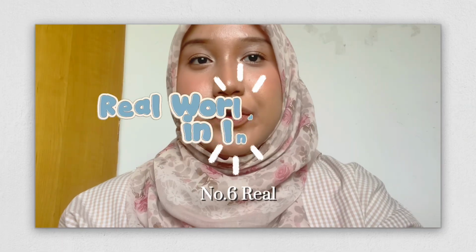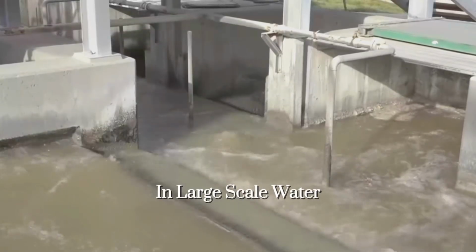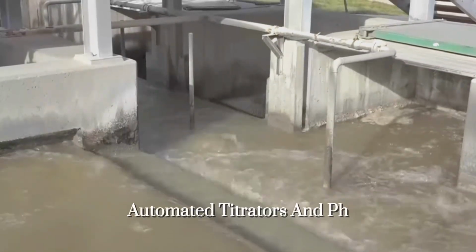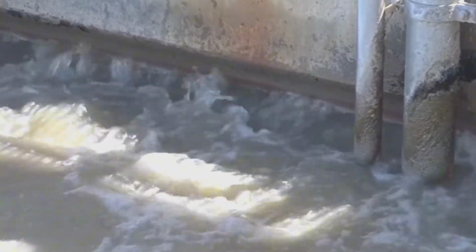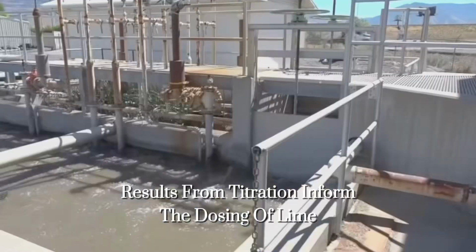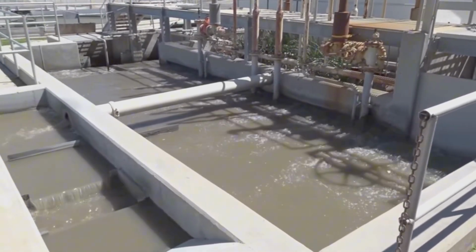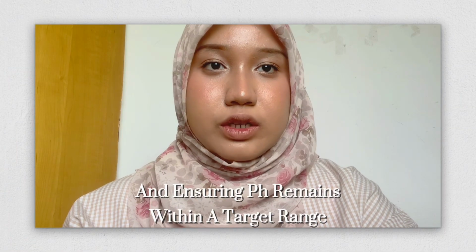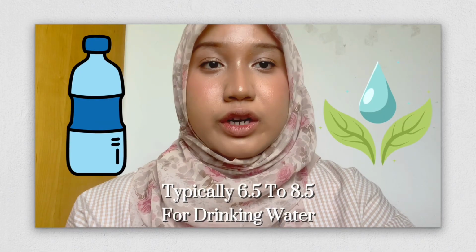Number 6. Real-world application in industry. In large-scale water treatment facilities, automated titrators and pH sensors are often used. Results from titration inform the dosing of lime, alum, chlorine, or other neutralizing agents, ensuring pH remains within a target range, typically 6.5 to 8.5 for drinking water.